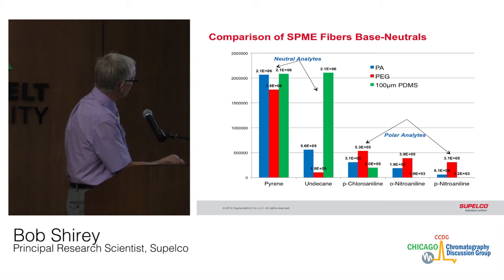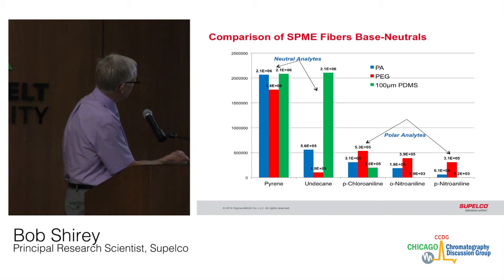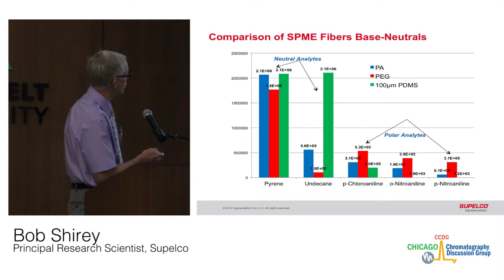The pyrene, with its double bonds, is actually extracted well by all the fibers, because polar fibers do have some affinity for double bonded molecules like the aromatics. But when you look at undecane, a linear hydrocarbon, you can see the PDMS is much better, and the PEG tends to repel hydrocarbons, so you can see the selectivity advantage that it has if you're trying to extract polar analytes that also contain some non-polar analytes.